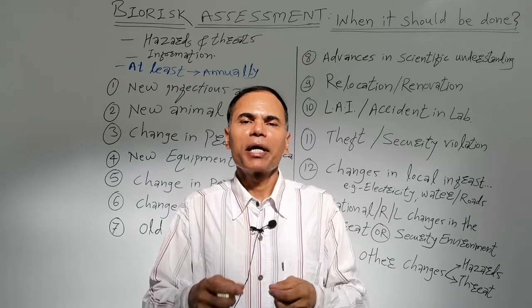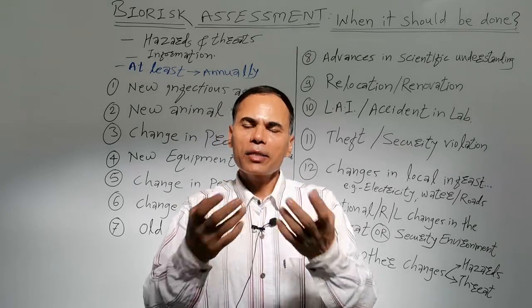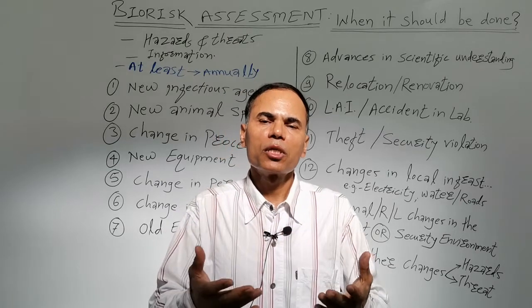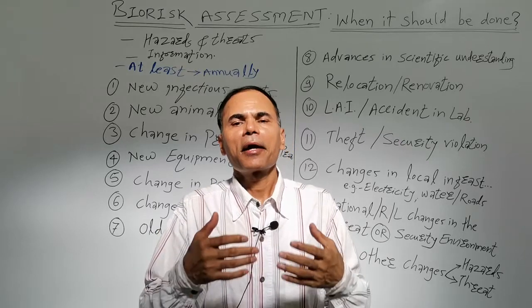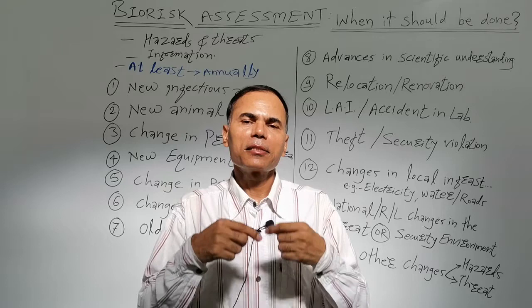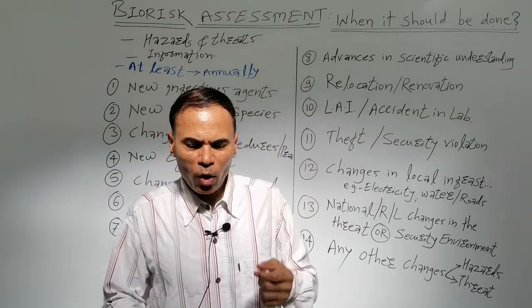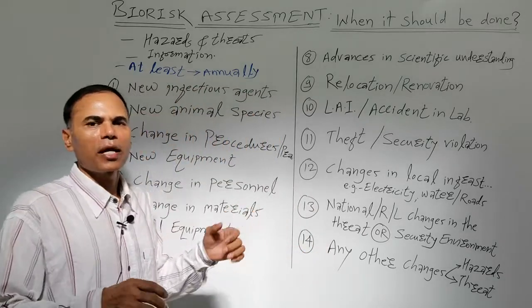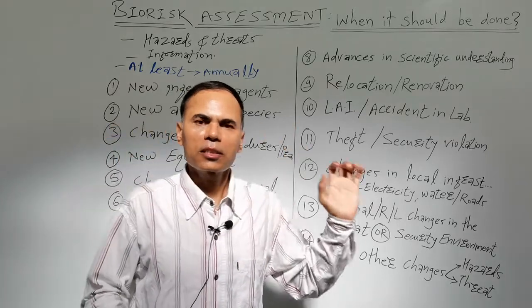In this video I'm going to highlight some of the scenarios when you can undertake the biorisk assessment. When research activities are going on, there will always be risk to the individuals, the surrounding community and the environment. So understanding the risk is very important, and for the risk assessment you have to make sure that you have the relevant information.